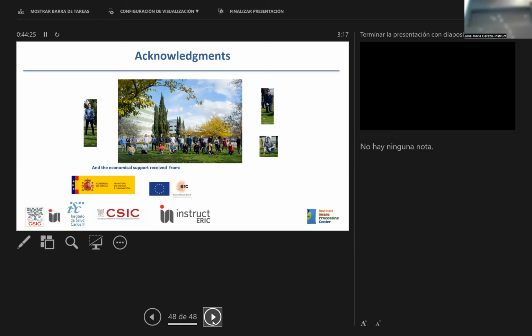And my second question, maybe a little bit provocative: are we at the stage where maybe we don't need 3D maps anymore? Are we at the stage where maybe we can get a good enough prediction of the model using AlphaFold or other prediction tools, and then just collect 2D data, then match the two, using the model to validate the 2D data, and then understand the homogeneity just on the 2D without needing a nice polished 3D?